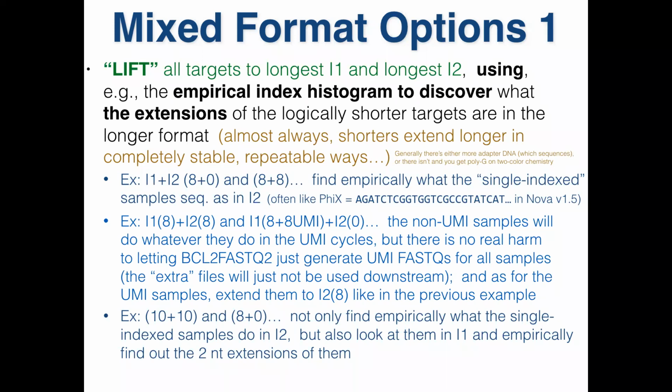So the nicer situation in that case is if you take the bases that are UMIs in any sample and throw those away from demux for all the other samples, so that the demux is done purely on bases that are not UMI. Hopefully, at that point, the samples are still distinct. And you could get unlucky at that point. It's really good in a world where it matters what the distribution of UMI probably is. Much better ahead of time to design the mix so that that does not happen.